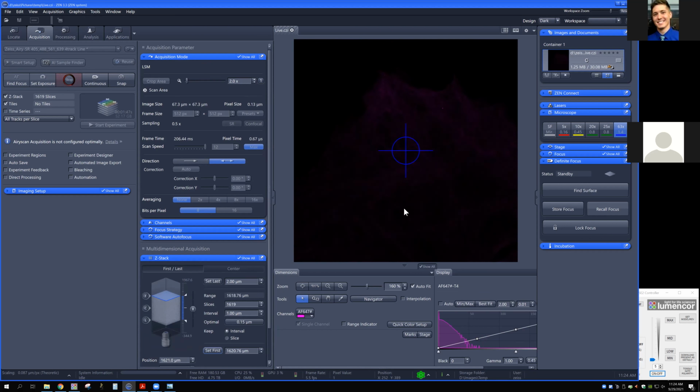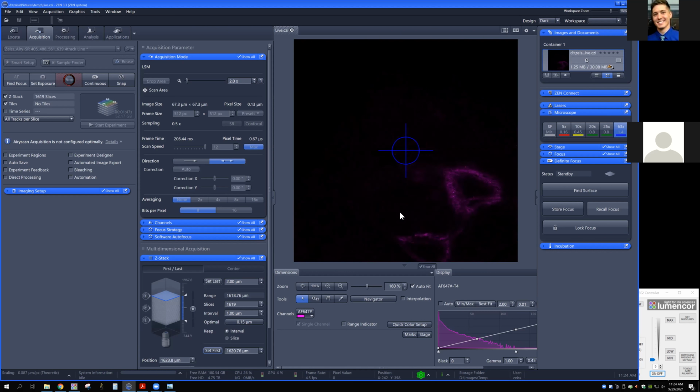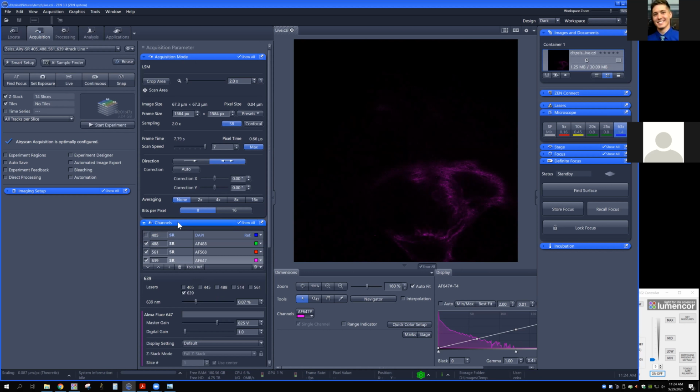I can set my first. Again, you can work with Airyscan using the same kind of dimensionality and everything that you would for any other confocal scan. Maybe I'll go to about there, see how many that is. You can use it with Z-stack, time series, tiles, anything you want to. It's just like using another type of confocal mode. Well, that's not bad. And so I'm going to make sure, did I turn off DAPI? No, let's just turn off DAPI.